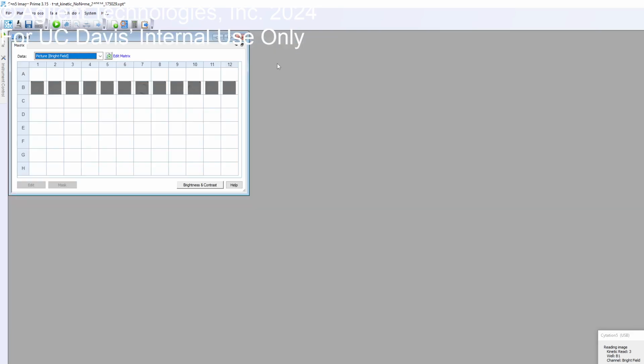Pretty good, right? That's all I need. Once this finishes the third read, we'll just abort it, and I'll help you align those images so you know how that works. Pretty straightforward, right? It's funny, it also records a little movie about what happened. That's so cool.